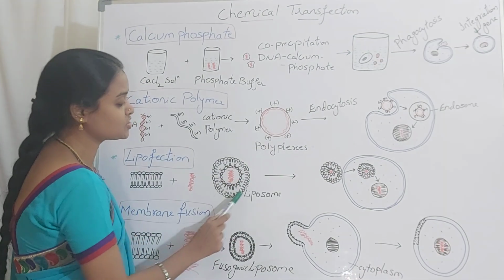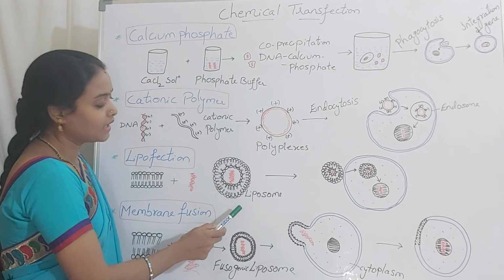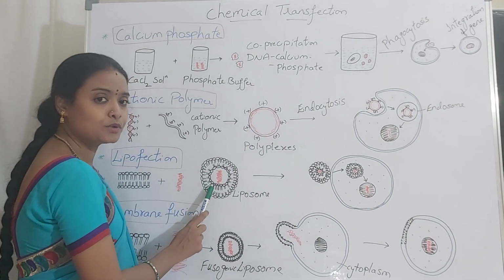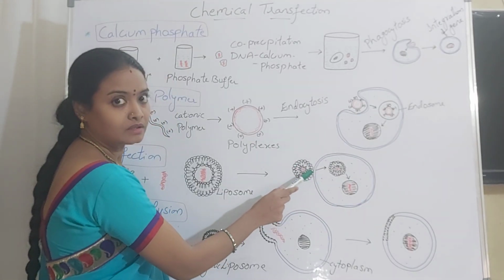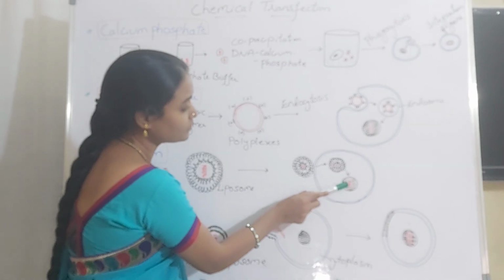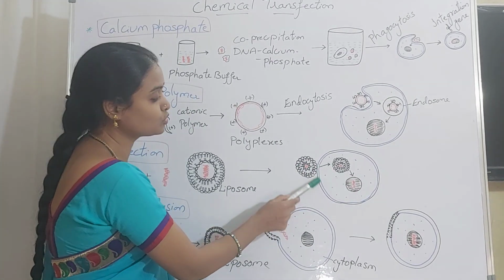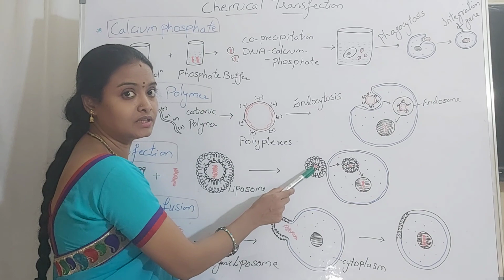So during this formation of liposome or the vesicle, the DNA will be trapped inside, and this liposome or the carrier carries that to the cell, animal cell. So now when you add this liposome to the container containing the animal cells, it will go and bind to the membrane, right, and it enters, and this vesicle helps your cell to get inserted with the desired DNA into its genome, right. The vesicle will enter through the plasma membrane of the animal cell, the vesicle carrying the DNA. Now you call it as vesicle or the carrier vehicle, right.